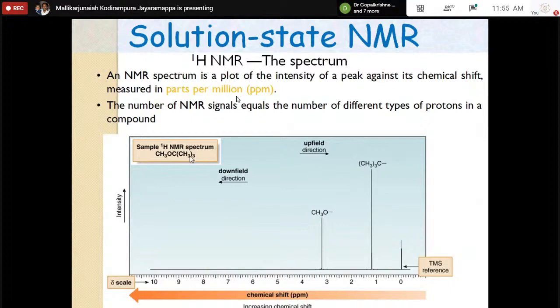There is a trimethyl group, a methyl group, an oxygen atom and a carbon atom. If I perform NMR, I get different independent peaks that help us identify the functional groups present in a given molecule. That is represented in the form of chemical shift.